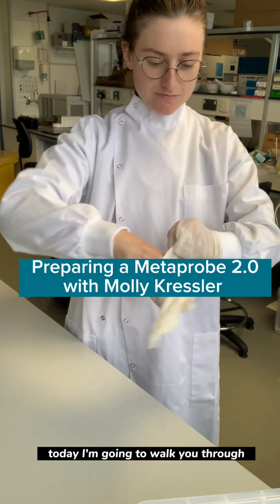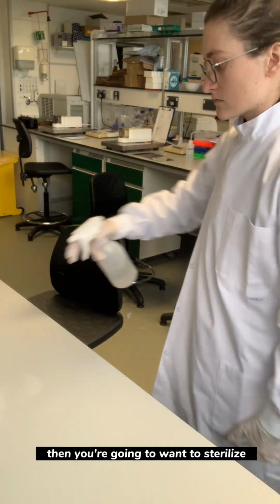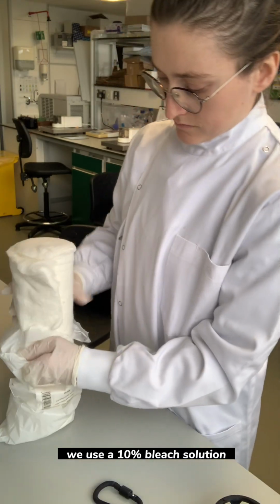Today I'm going to walk you through preparing a Metaprobe 2.0 for sampling. So gloves first, then you're going to want to sterilize your workbench area. We use a 10% bleach solution.